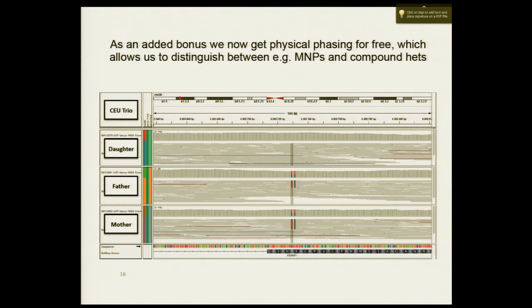This is incredibly important for people who are worried about the functional annotation implications of these changes, right? Because if you consider these changes independently, you're going to come up with a different answer than if you consider them in concert. Furthermore, in this particular example, some pipelines, when they call individual SNPs, mistakenly filter out the first SNP but not the second.